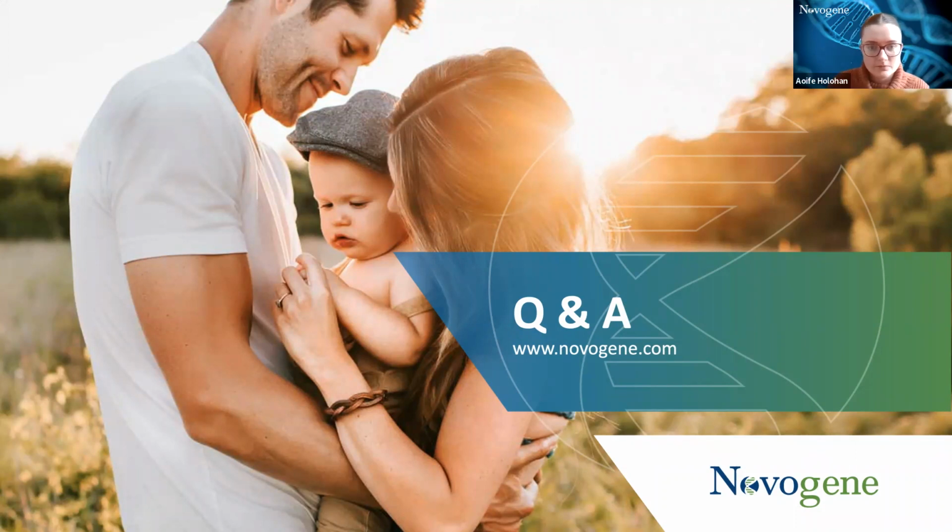Next question is from Ella Mofi asking, my project was done in 2020. Am I eligible to use NovoMagic to reanalyze the results?